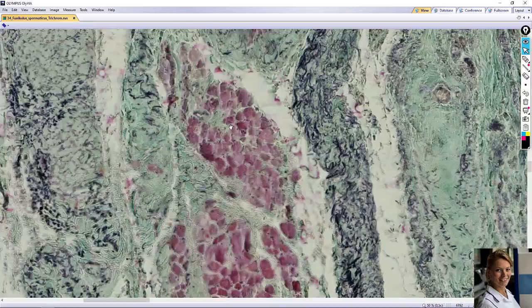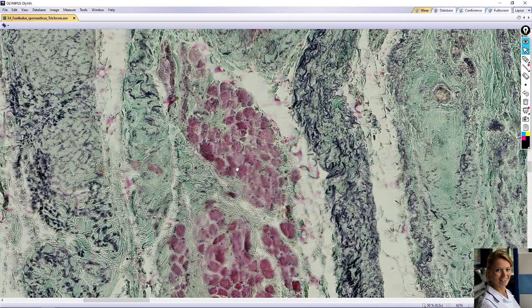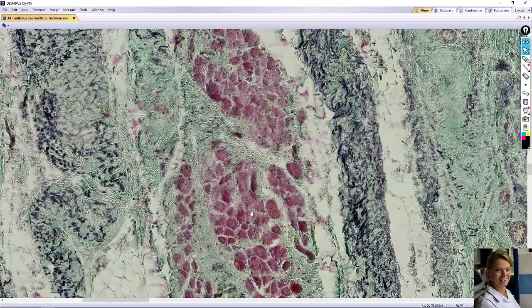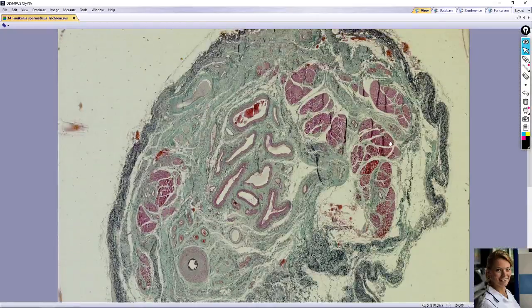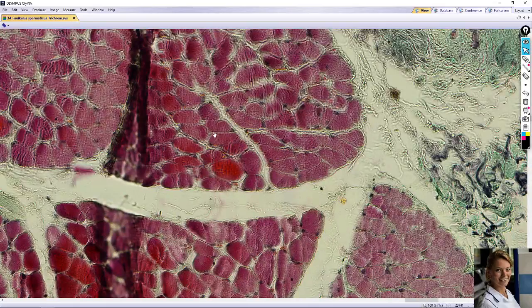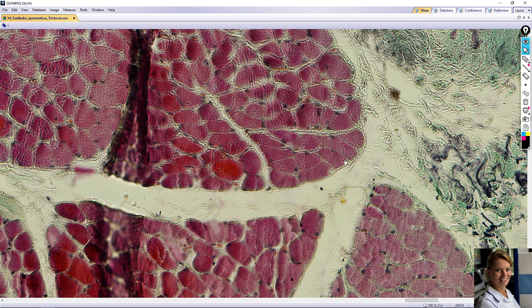Here you can see skeletal muscle with typical periphery nuclei here. Here is also skeletal muscle with typical periphery-located nuclei here. Black nuclei of the skeletal muscle bundle.